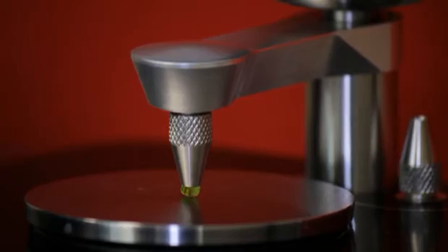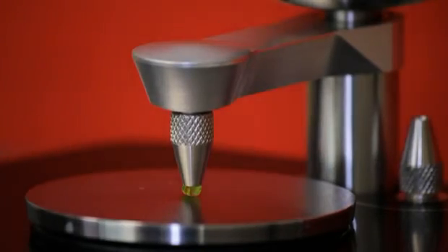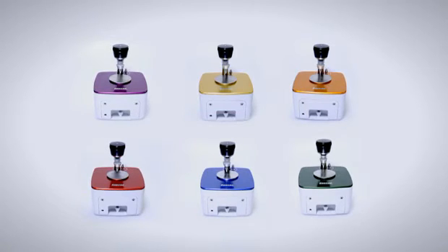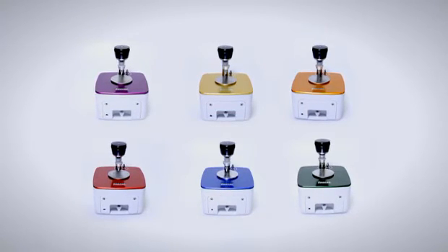There is an audible click when the knob has reached the pressure load limit of 40 pounds. The Quest ATR accessory is available with a choice of seven top plate colors.